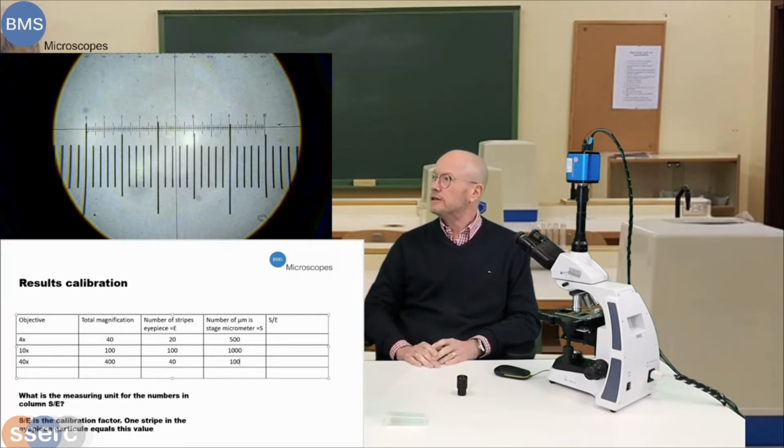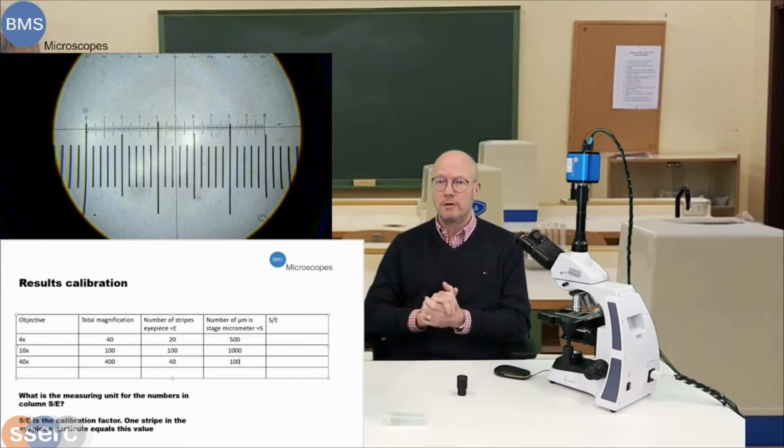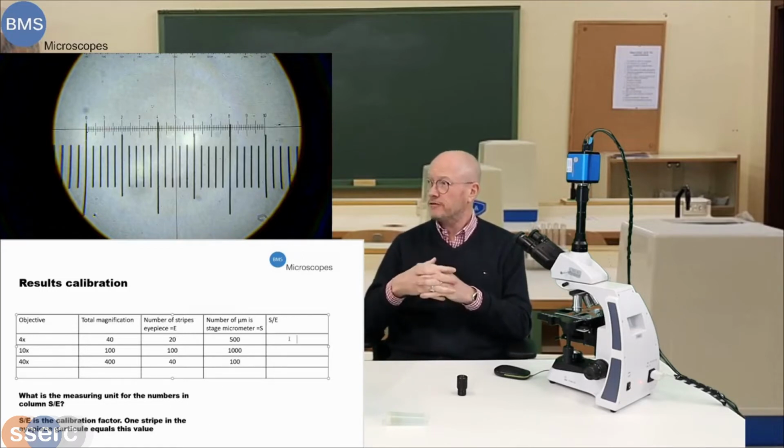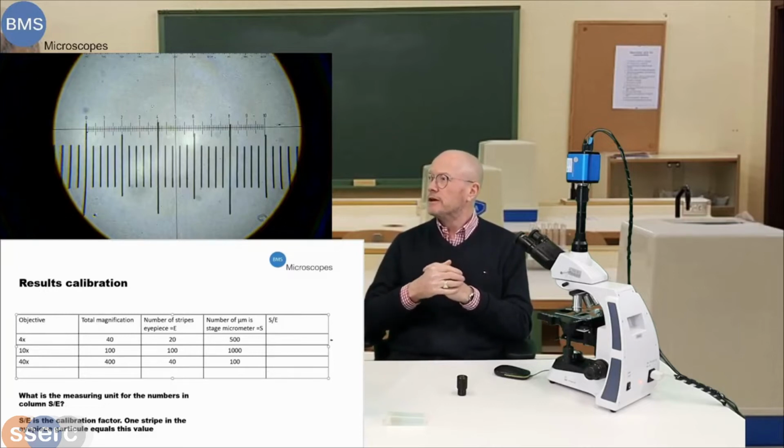Now we can do the calibration of the calibration factor of the several objectives. Let's start with the 4 times objective, the 40 times total magnification. The factor is 500 micrometers divided by 20, that's 25.